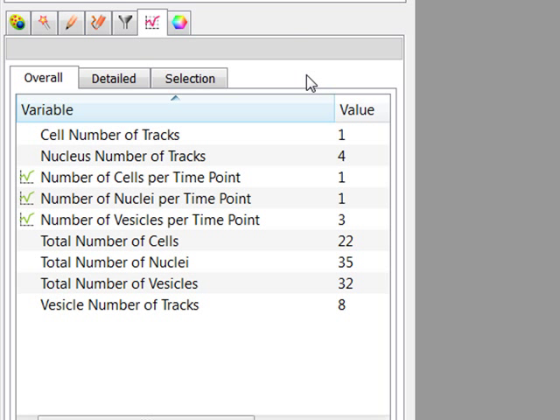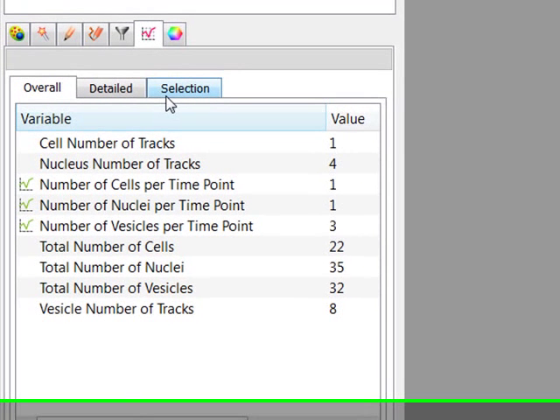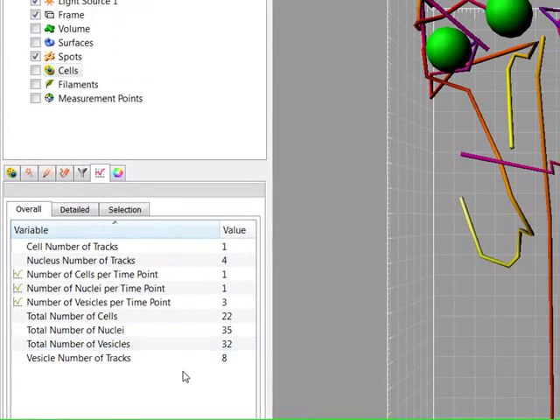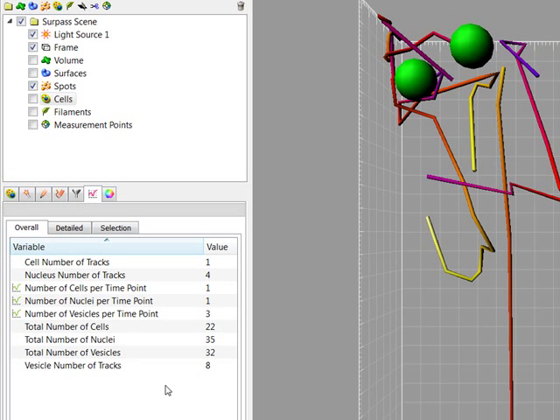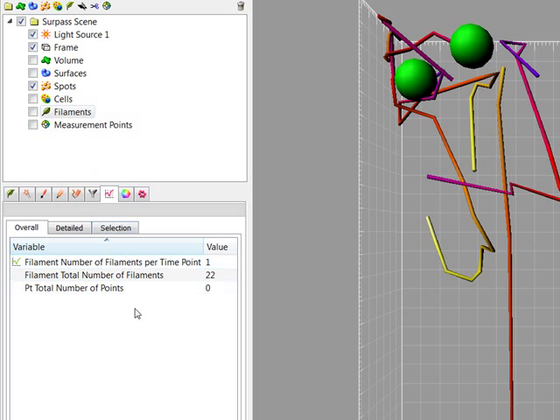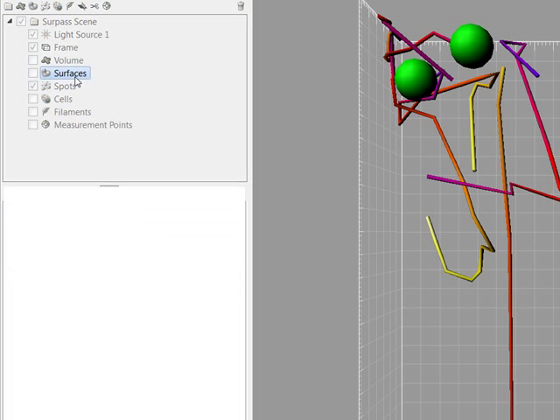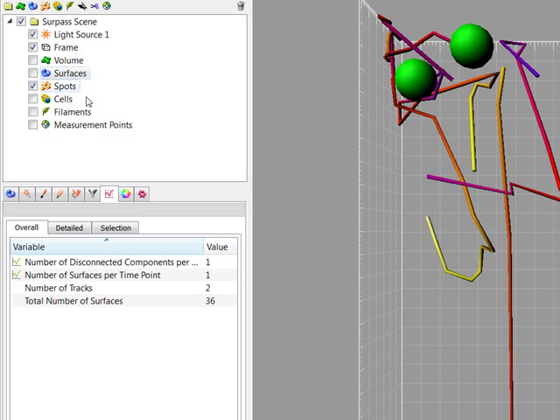There are three statistical tabs – Overall, Detailed, and Selection. The output of the Overall statistics provides an overview of the general determining variables. Only statistical values that are not measured on a per-object basis are displayed here.